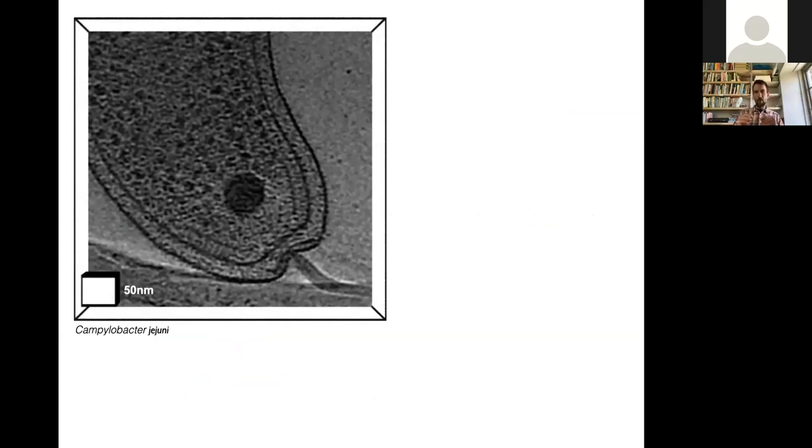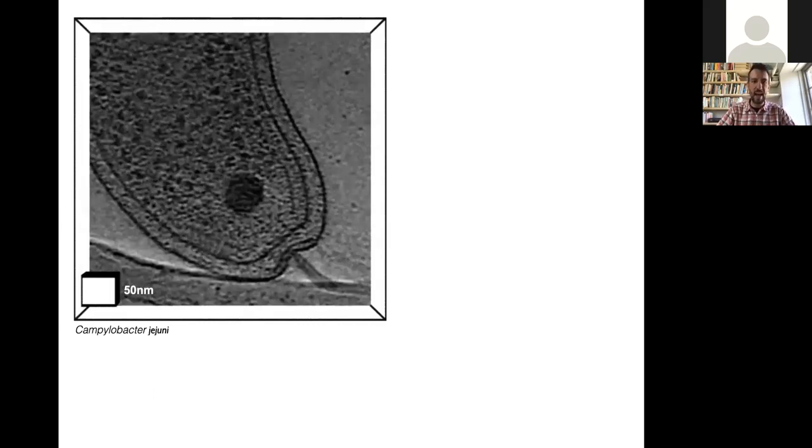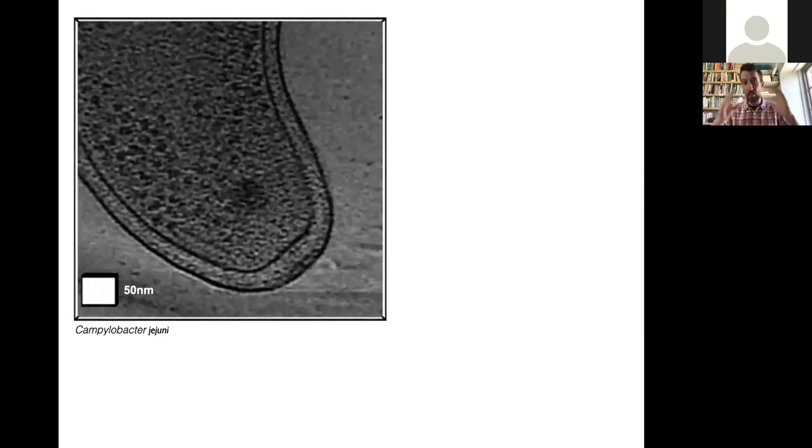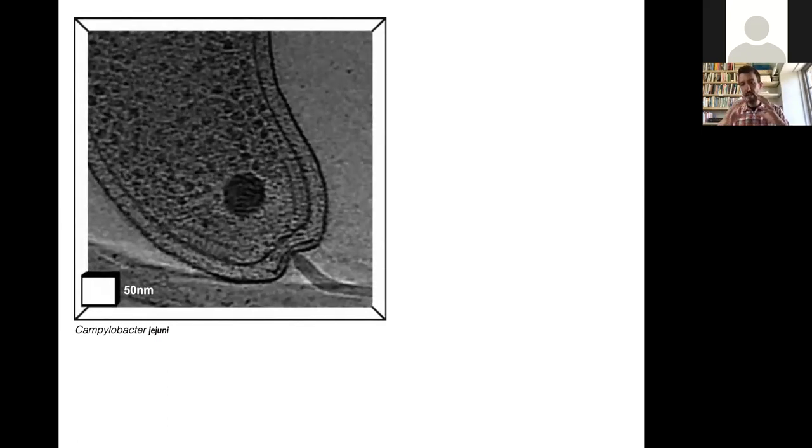This is actually a slice through a three-dimensional rendering of an entire cell pole with an embedded bacterial flagella motor. In electron cryotomography, what we do is we flash freeze our specimen and then take images of it in an electron microscope over a range of angles. We can then take those images and in a manner directly analogous to a CAT scan or CT scan, we can reconstruct the three-dimensional model of the bacterium.